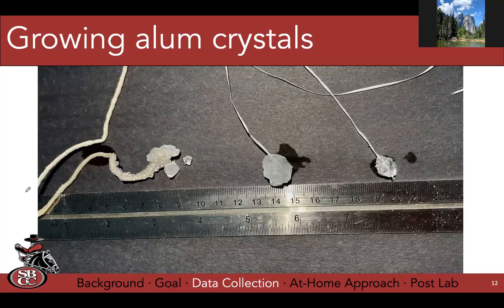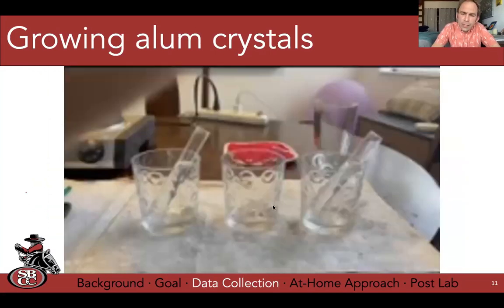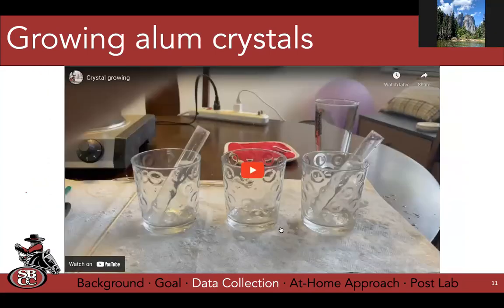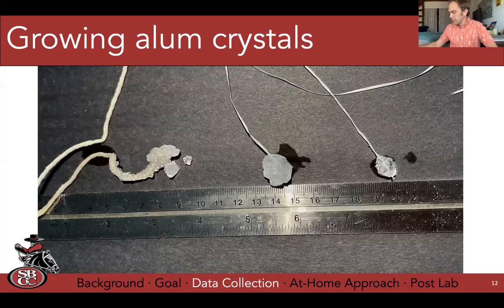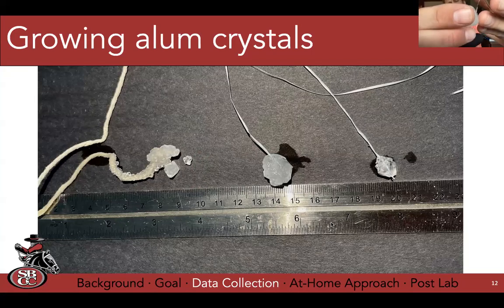Oh, no, sorry. I was going to ask what you meant by jagged. Oh, so I was just seeing, well, I'll show you. I would call this crystal jagged with lots of little edges. And I would call this crystal very smooth, very straight lines, very clear, right?